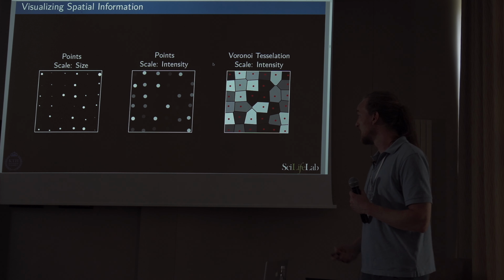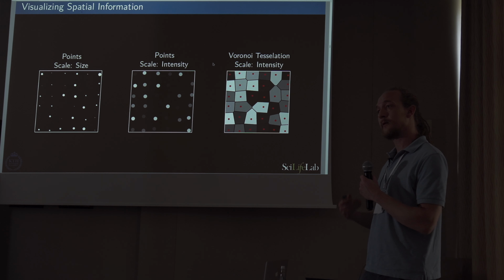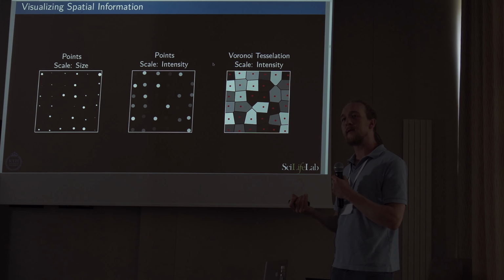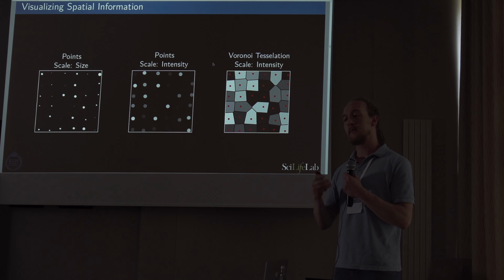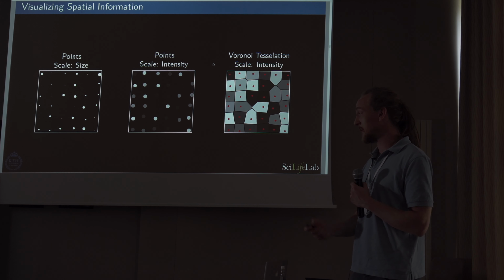For this reason, I think it's good if we can maintain such kinds of matrix plots, which you can easily make in the case of regular spatial data in the form of an exact grid.